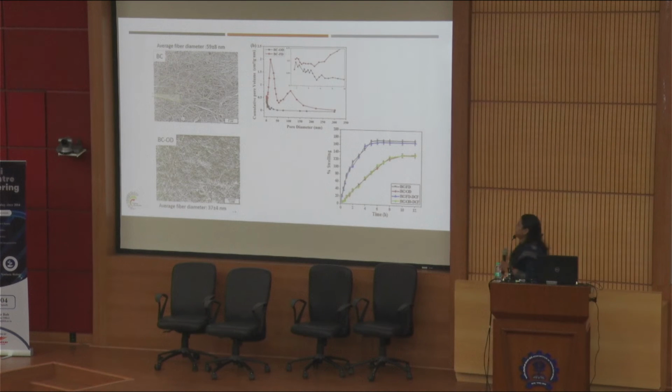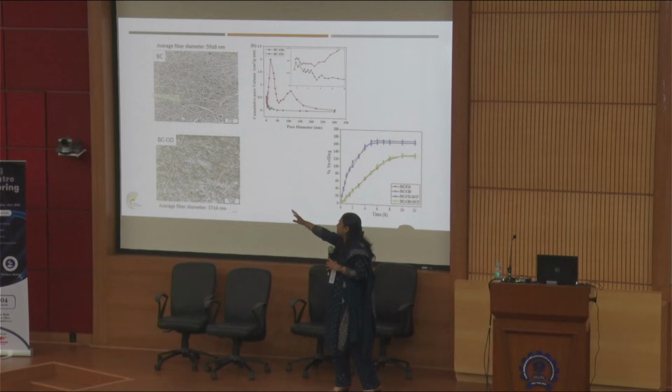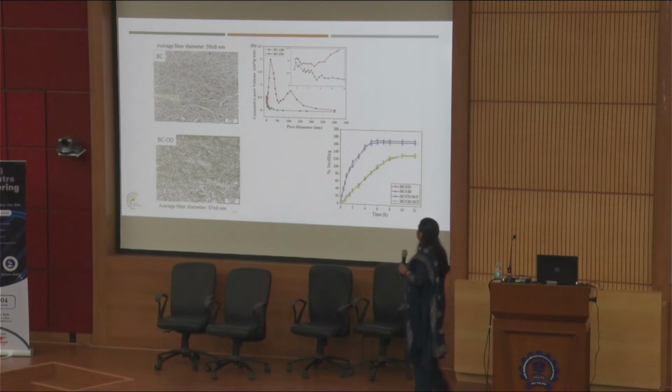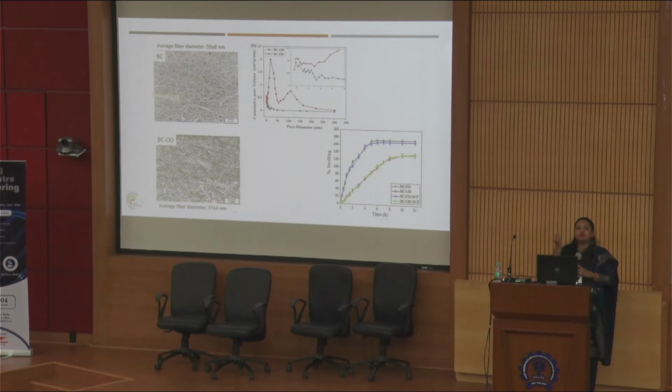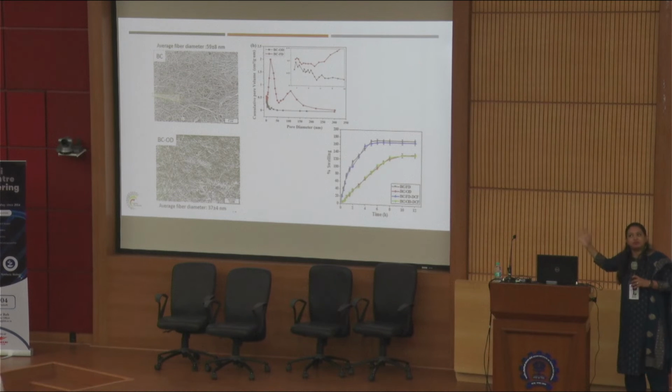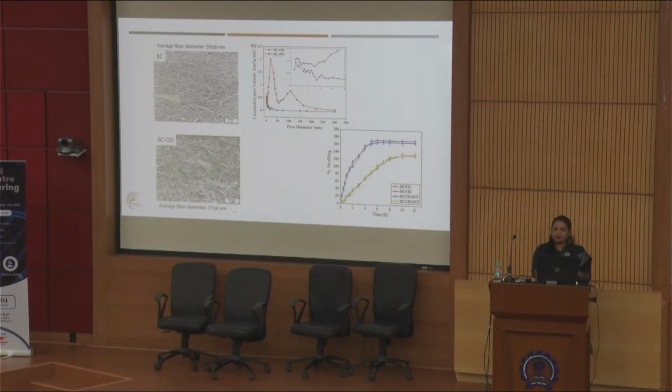The beauty of this material is that when you dry it, you can see lots and lots of pores. These are electron micrographs on my right hand side. You can see lots of pores are there, different sizes of pores are present. And of course, this is the data which verifies the same. And it has a very good swellability. And when a material has very good swellability and retentability, it's not going to dry up very quickly, the very problem that I said existed with the paper-based devices.